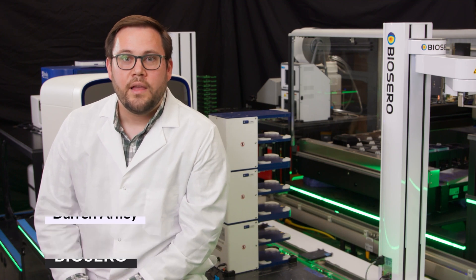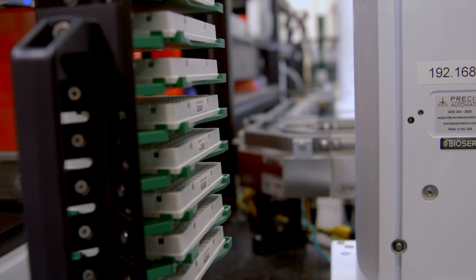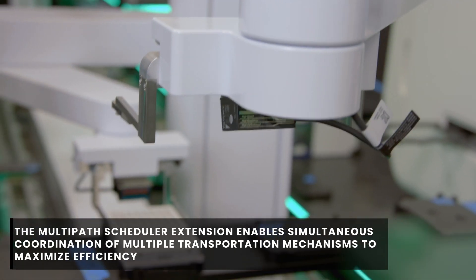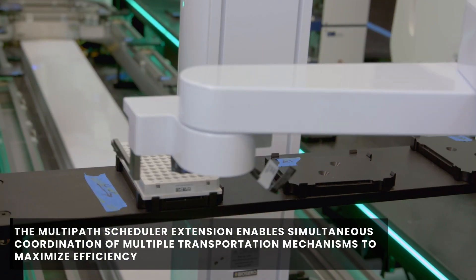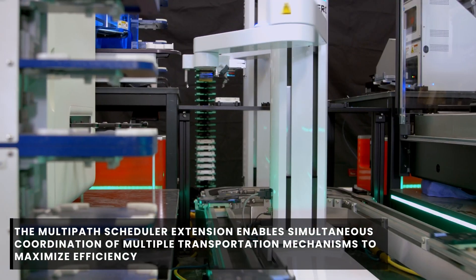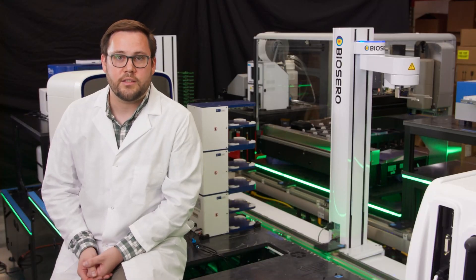Hi, I'm Darren Arney, Field Application Scientist with BioSero. You'll notice the system behind me has a wide array of automated laboratory instrumentation. Using the power of BioSero's Green Button Go Hardware Agnostic Automation Scheduler, we can use any combination of the instruments, robots, and track systems available on this platform to make sure that we are executing the most efficient process possible, based off of the multiple experiments that scientists may want to run on this system at any given time.